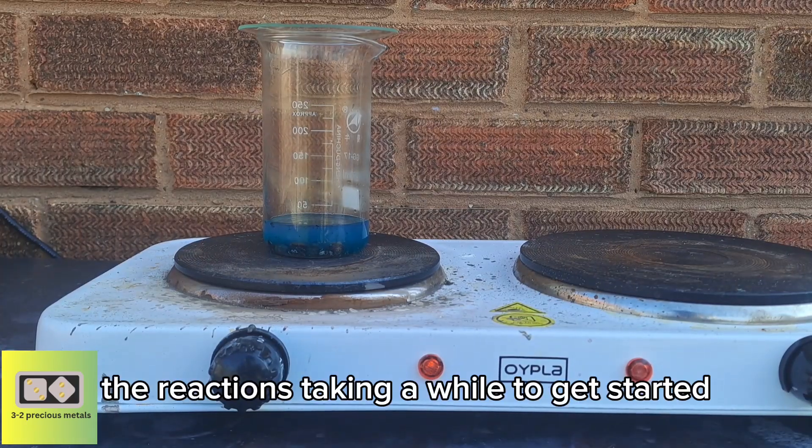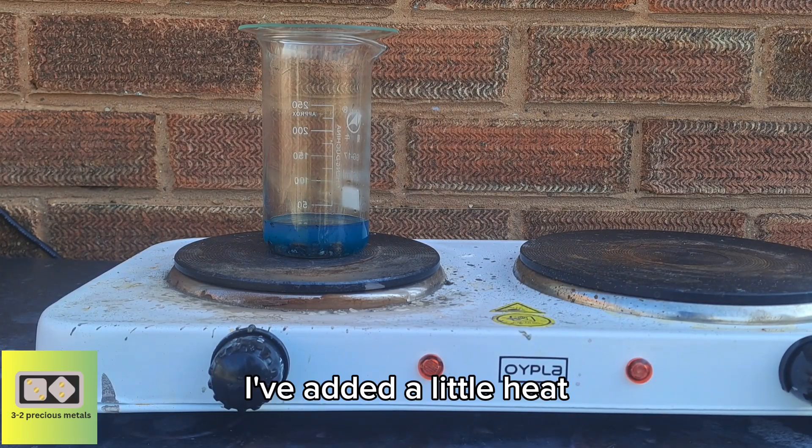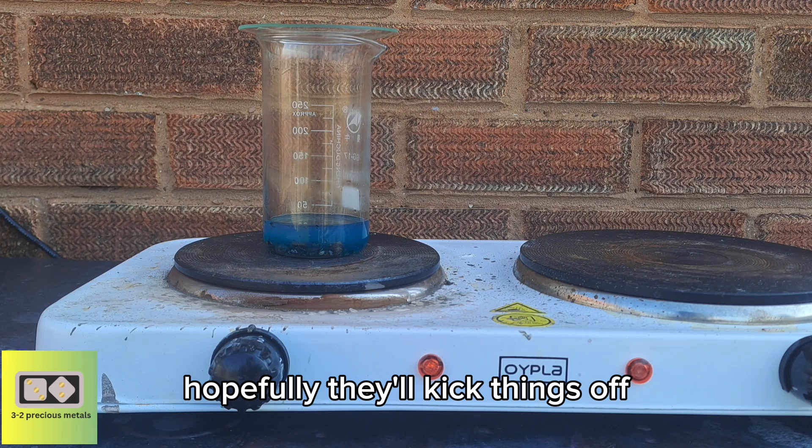The reaction's taken a while to get started, so I've added a little heat. Hopefully that'll kick things off.